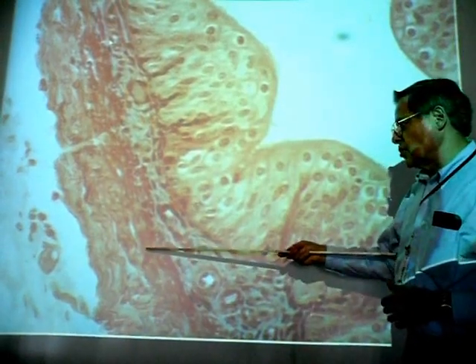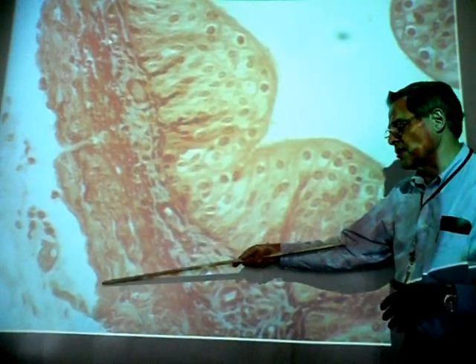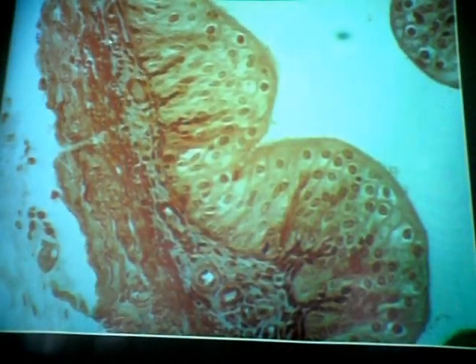Smooth muscle, longitudinal, smooth muscle, circular. Or you say longitudinal smooth muscle, circular smooth muscle. And that's the ureter. Next, outside that, you've got more connective tissue. You can see it here, it's kind of a grayish layer.